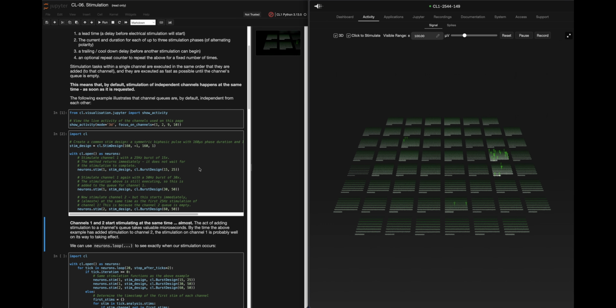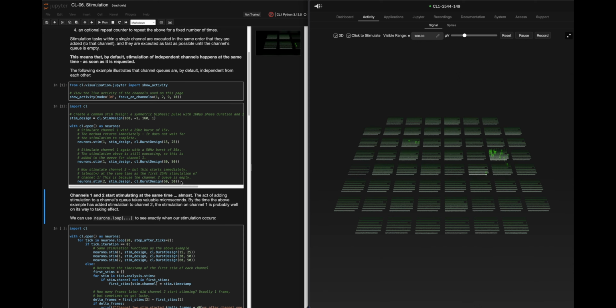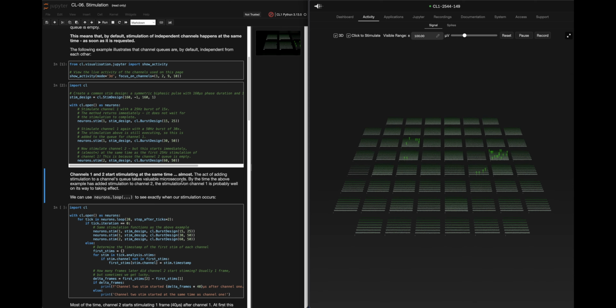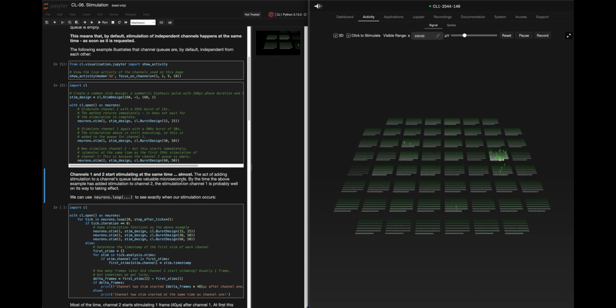So you want to design smaller stimulations and really find and fit what works right for you in your use case. Because what I found is that some of the gaming applications that make the neurons play a game are actually not good for longer term data collection. They cause decline in the activity or unpredictable activity of the culture, and it makes it so you can't even collect good data.